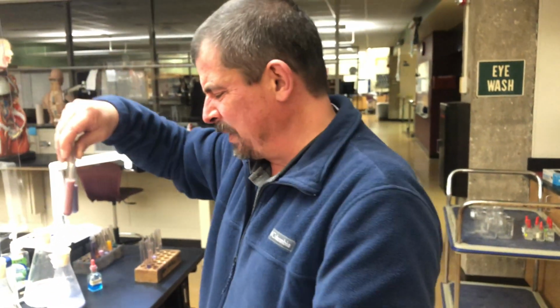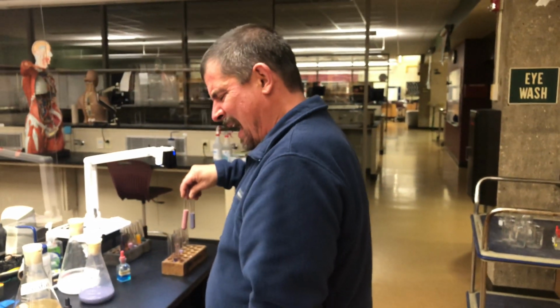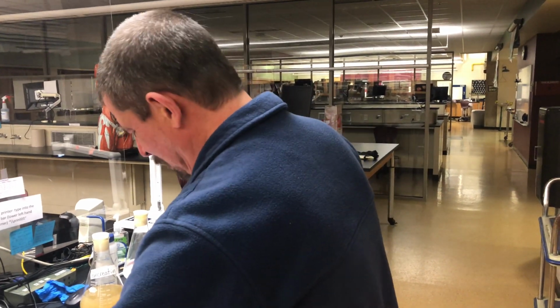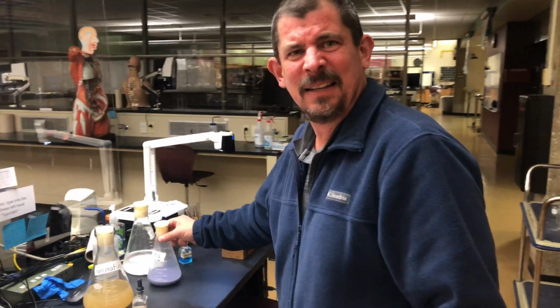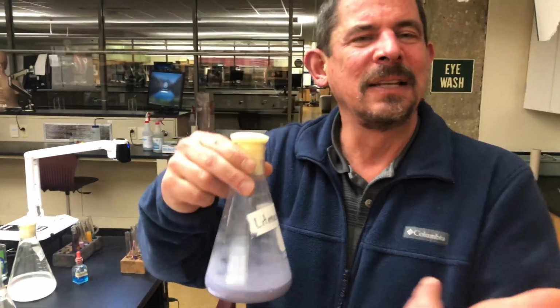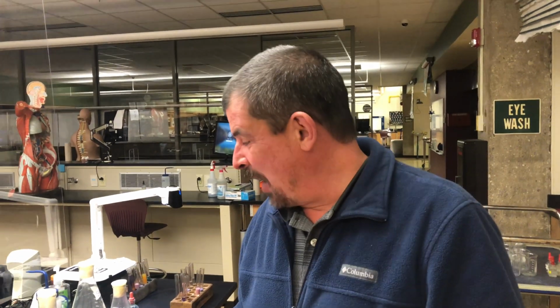And so we put those back, and then if we answer the bottom question, what is the purpose of using litmus in this experiment? Again, the litmus is what makes the milk change. The litmus is quite simply a pH indicator. It's just a pH indicator. Again, what do we use pH for? To test for acidity. All right, so now we go over to page 47 in your checklist.